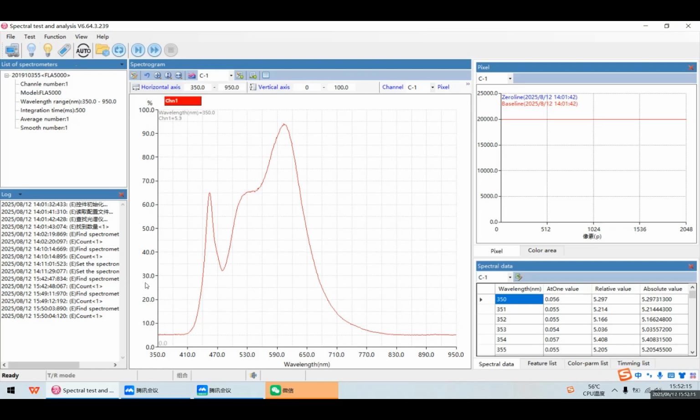Percentage of light passing through. Before we test, a background is required. For the background, just turn off your light source and keep your surroundings in a dark environment. Then turn on the light source, make a reference, click again and click Single Test.